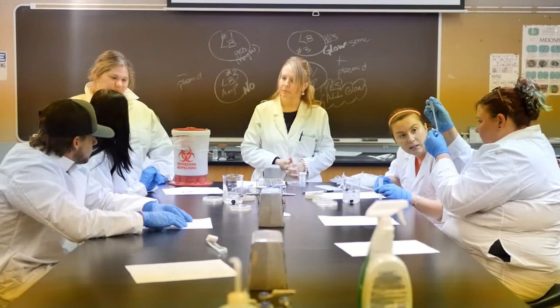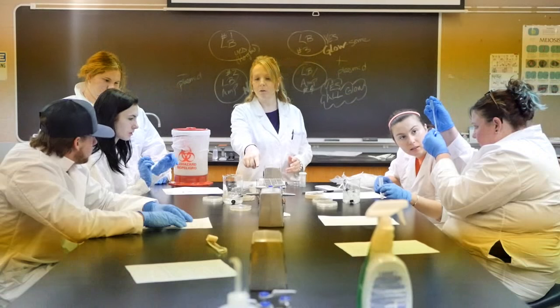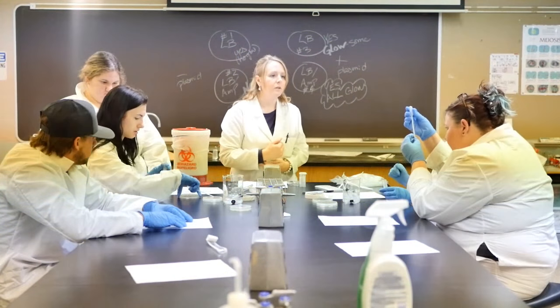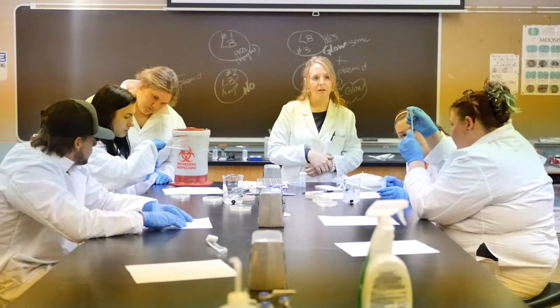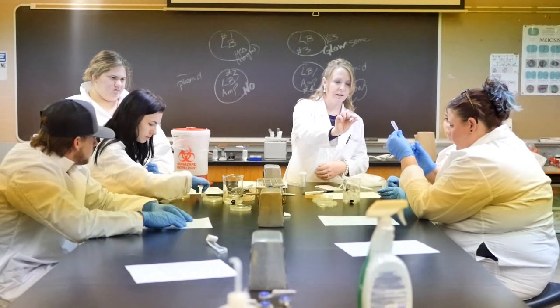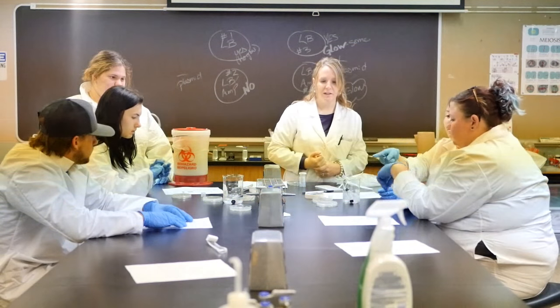So your little broth is going to go onto each plate. As soon as you have your 100 microliters onto your plate, you're going to want a new pipette because you've touched the tip. It has to remain sterile.